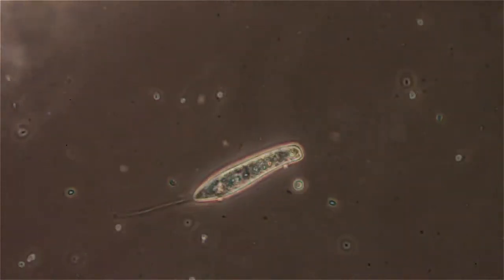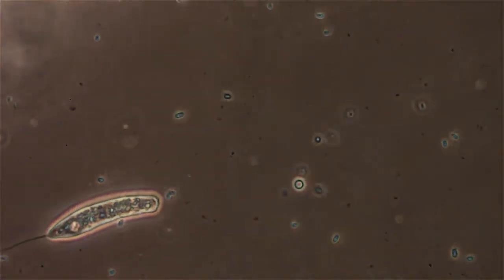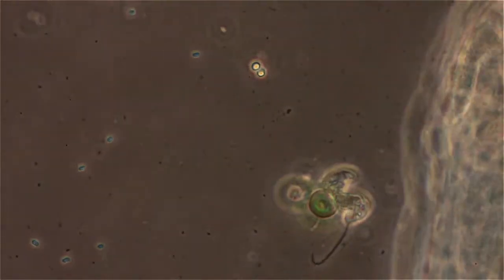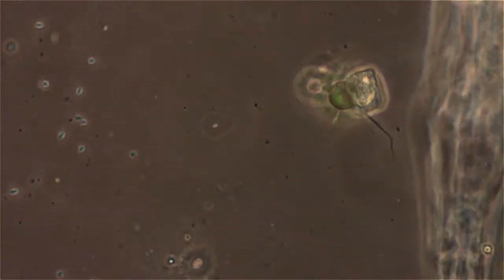Some of these little white dots floating around, not swimming, but floating are brewer's yeast. There's a double set there.